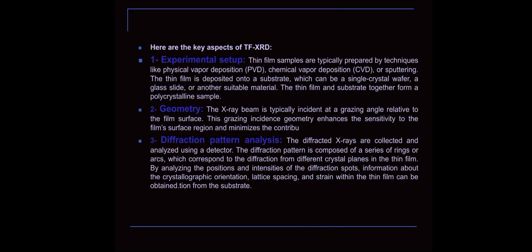Here are the key aspects of thin film XRD. Experimental setup. Thin film samples are typically prepared by techniques like physical vapor deposition, chemical vapor deposition, or sputtering.